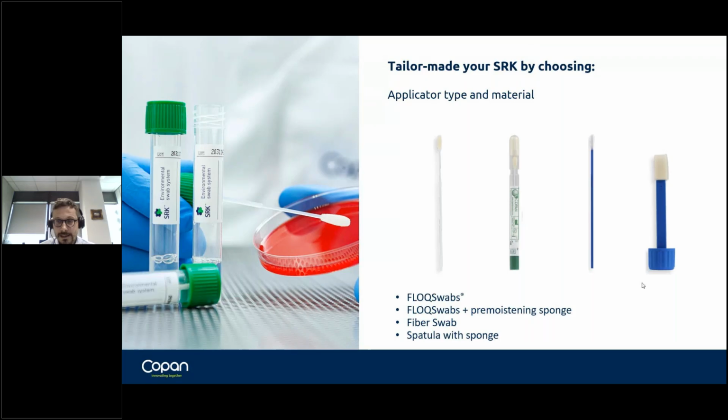For pre-wetting the swab, you don't need to physically dip the swab into the SRK solution, you simply push the bottom of the tube. The sponge releases the SRK solution that pre-wets the swab, and at that point you can remove the swab from its tube, and you already have a pre-wetted swab for taking the sample from the surface.